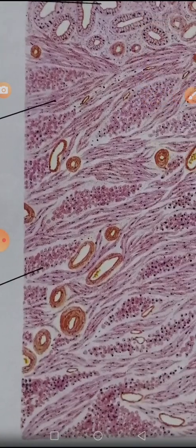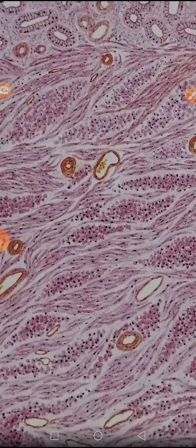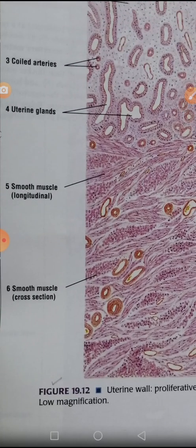And the myometrium is basically you have all the muscles going in different directions. Sometimes you see them in a spindle shaped formation and sometimes in a dot formation. That is because the fibers are going in different directions. So this is the myometrium that is represented. In this one the perimetrium is not shown. The perimetrium can be serosa or adventitia depending.